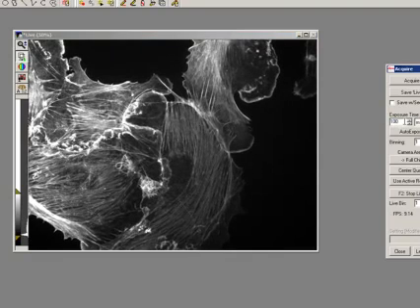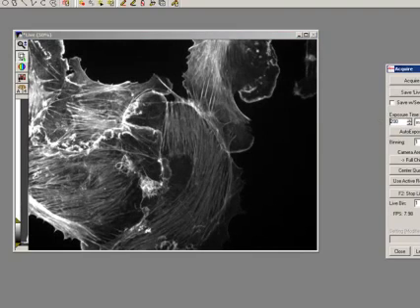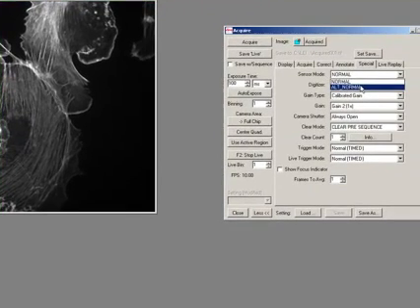What that does mean is if I move to 100 millisecond exposure time, my image doesn't get much better, and again at 200 milliseconds you can see it's a little bit better. All I'm doing is increasing my signal over noise. You can see that's a 14-bit image, so it's a nicer image. Obviously I'll hit saturation at one point, but 100 milliseconds gives me a 12-bit image, 10 frames a second, good for focusing and doing work, and the image looks pretty as well.